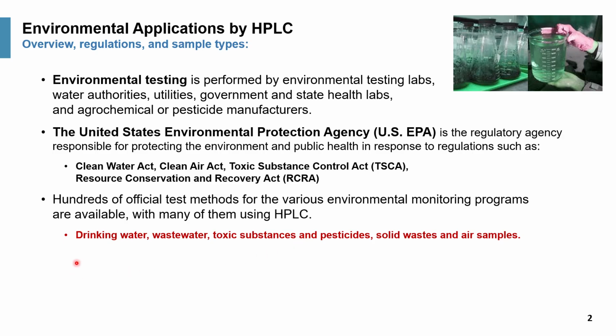There are 5 categories of samples listed here for these environmental testing. First one is drinking water. Then wastewater, toxic substance and pesticides, solid waste, and also air samples.